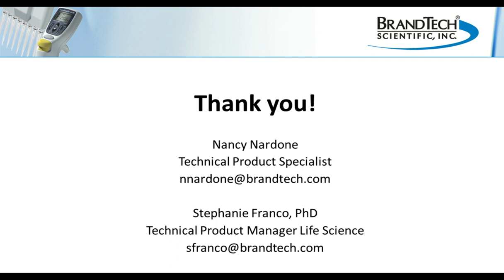Great, thank you. And are there any liquid detection modules with the larger liquid handler? The liquid handler that we have, the LHS, does not have liquid level detection. It is a manual process, so you do have to tell the system how much liquid is there and be kind of reliable about it.